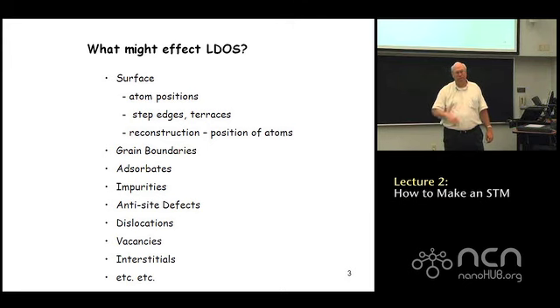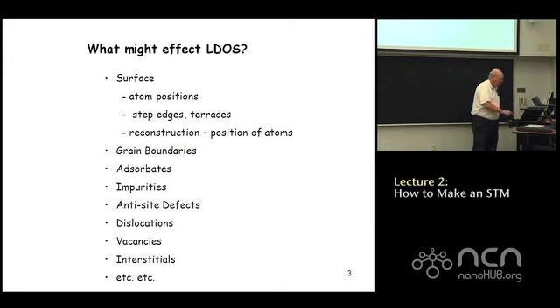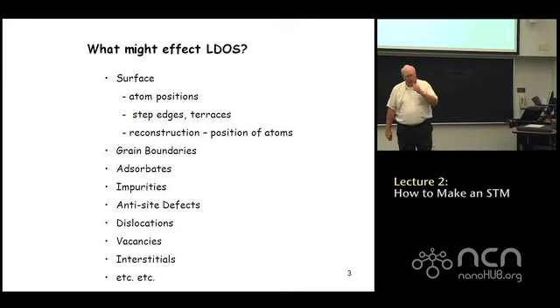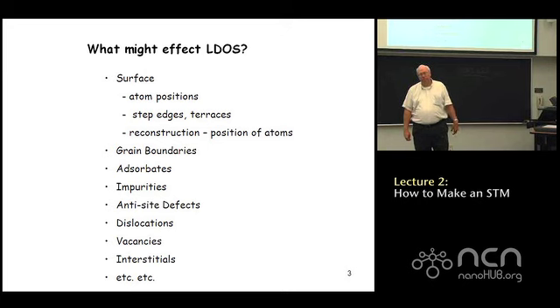There's a question. Going back to the previous slide, you talked about vacancies. I was wondering, in effect that suggests that subsurface effects would be picked up, because you have a vacancy a few atoms below. It might affect the local density of states and in fact affect the image you take. How deep is this penetration? Subsurface from the top, I mean, picking up features that might be involved here.